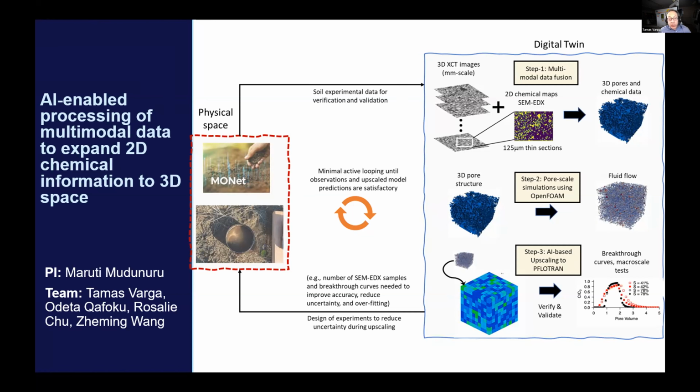Ideally, in some cases at least, we hope that by doing CT and running the AI, we can get an initial chemical 3D map on some of the stored aggregates.